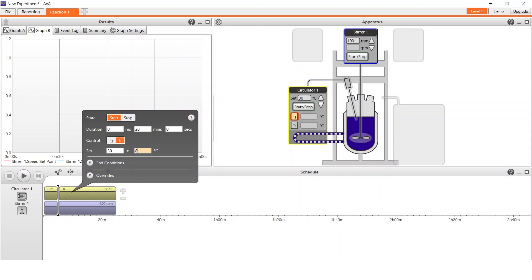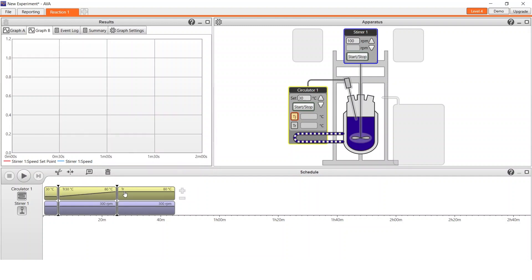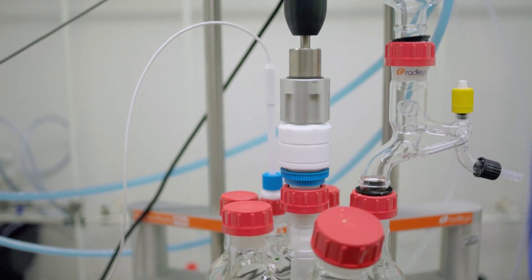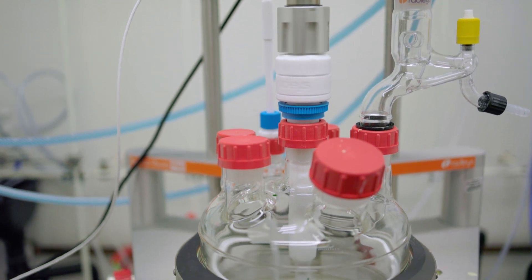Before I start my work I can build an entire process and then run it whenever I want, but it also has the flexibility that I can stop it and then use it manually on the fly, so I can turn on the stirring, turn off the stirring, or just heat and cool whenever I like.